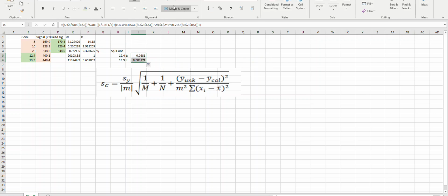And I'm going to go home. I'll get these sig figs under control here. So now, actually 2 sig figs is perfect for this. And that means that this guy, actually, we should display 2 more sig figs.